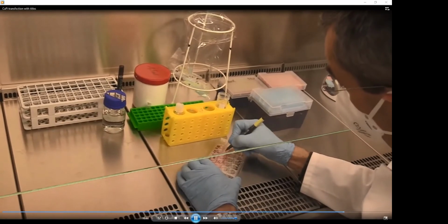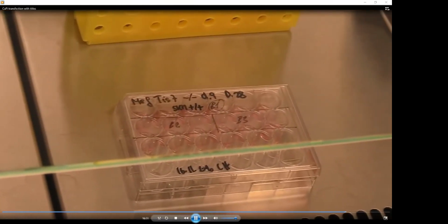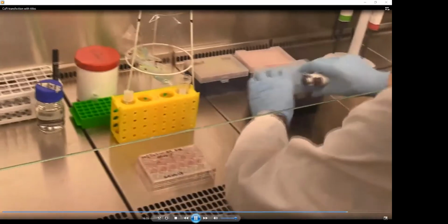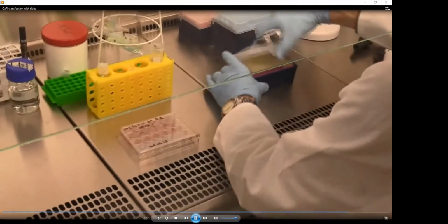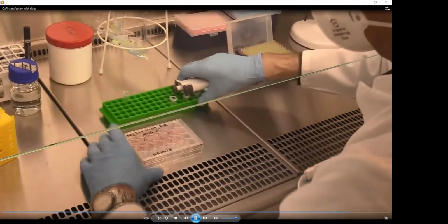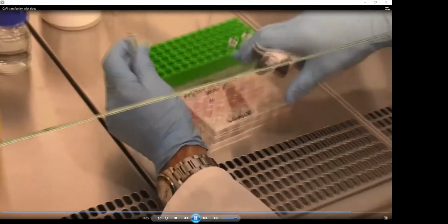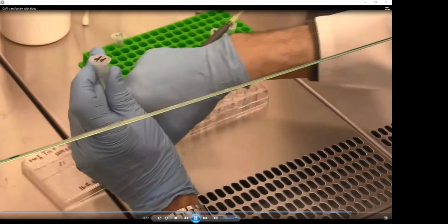Then it's important to label it properly. So this is a very important step. Don't forget to do it when you do the experiment yourself. As you see on the top, we have B1, 2 times 3 samples, because one will be then treated with lithium chloride, the inducer of Wnt signaling. And then we have samples B2 and B3.